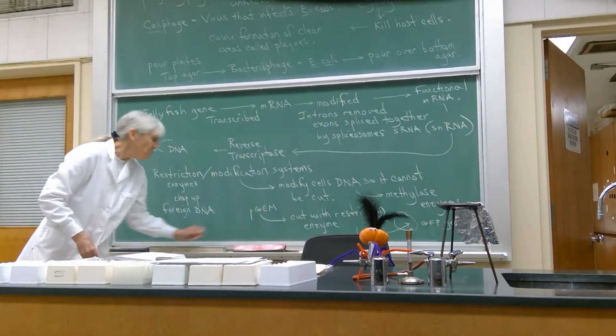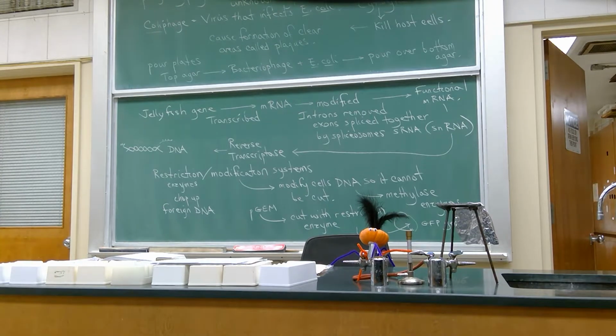Four bottom agar plates per group, and the bottom agar plates are currently in the incubator because it helps if they're warm for this exercise.